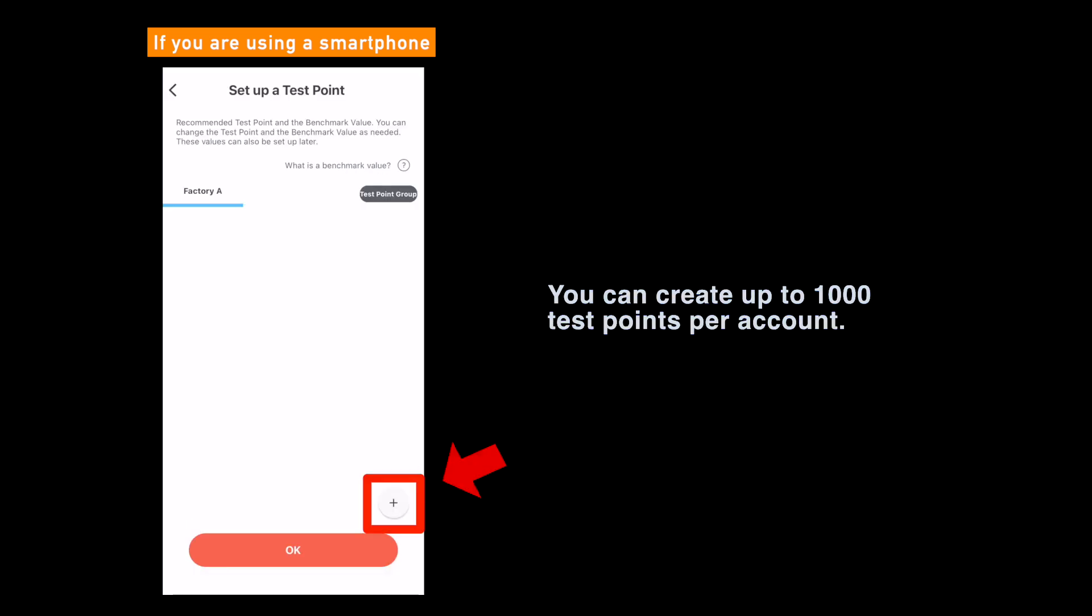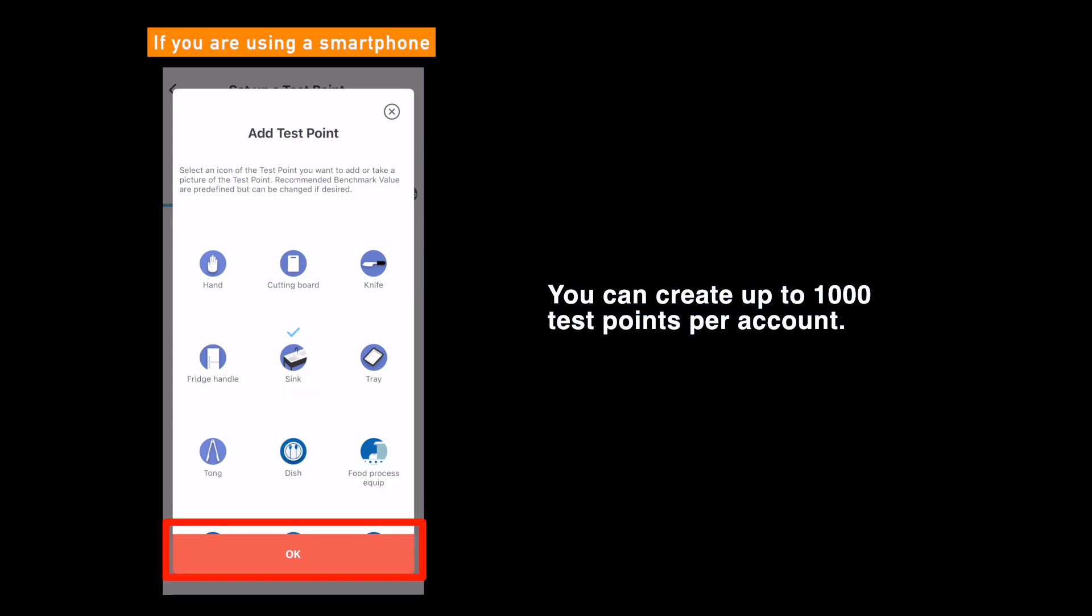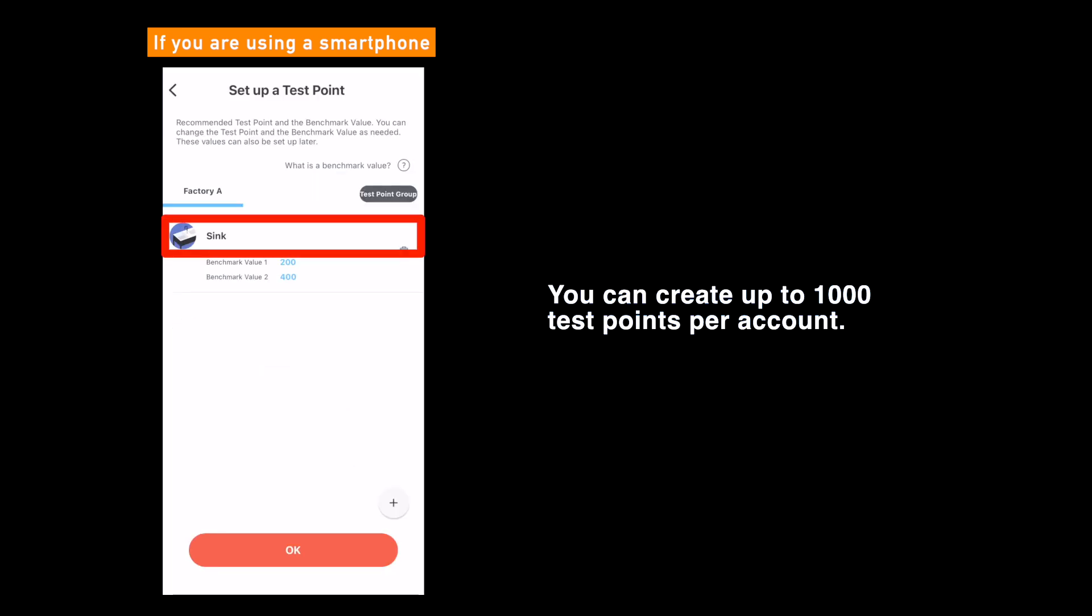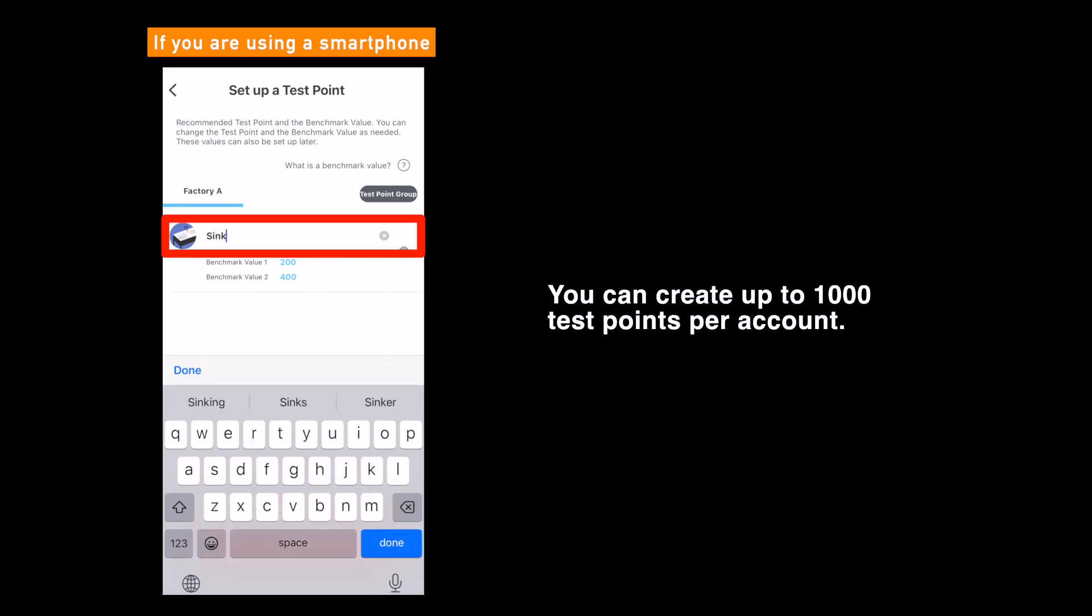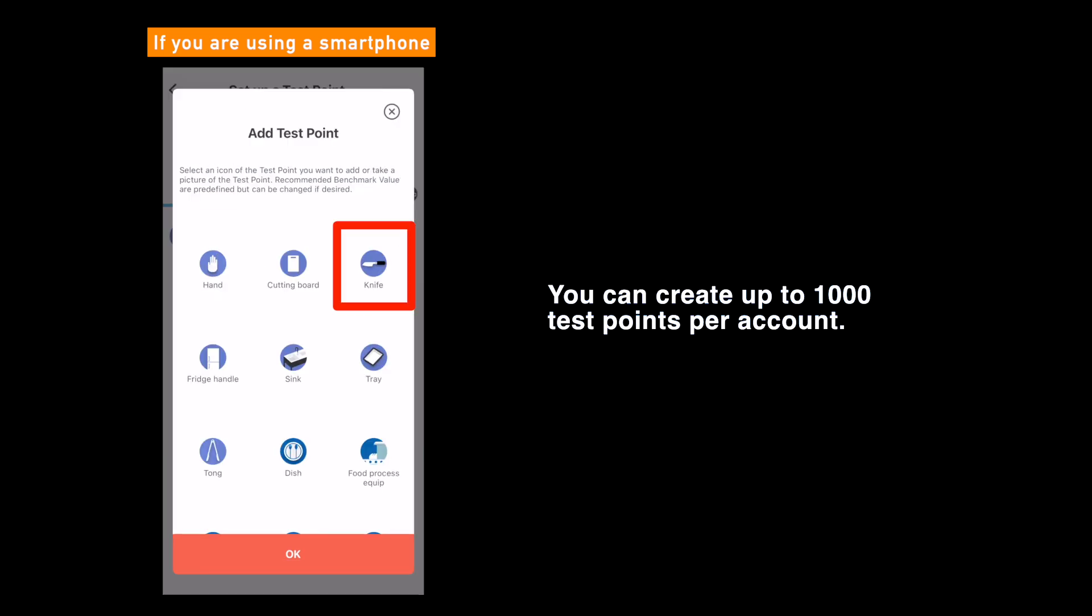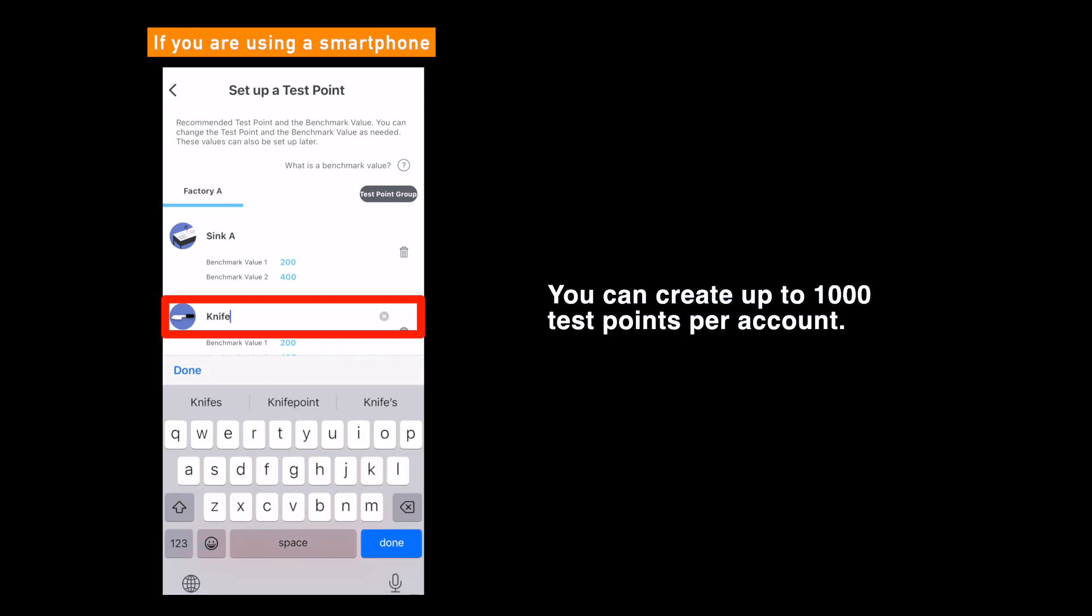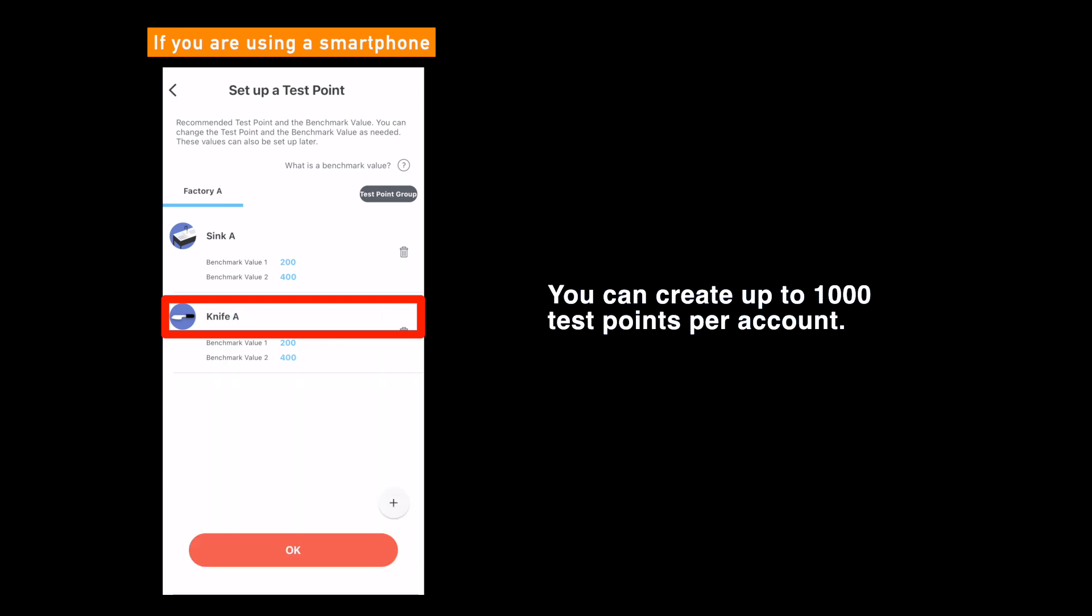Next is test points. Tap the plus button on the lower right side, select the icon you want to use in the pop-up screen, and click or tap the ok button. As explained earlier, you can also change the name and the benchmark value of test points. Repeat these steps until you have added all the test points you need and tap ok at last.